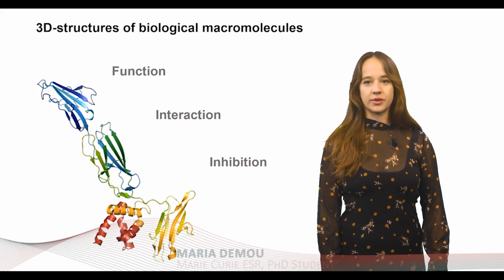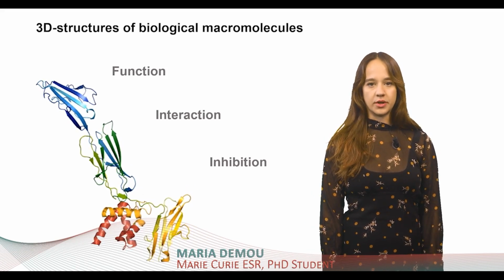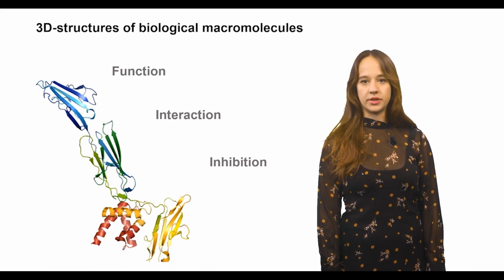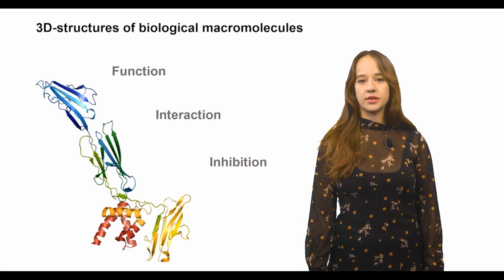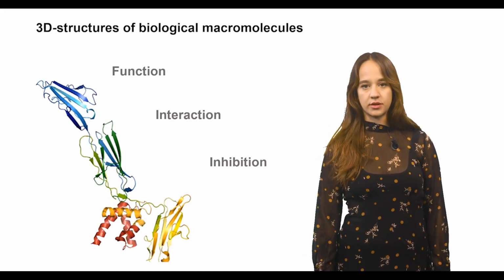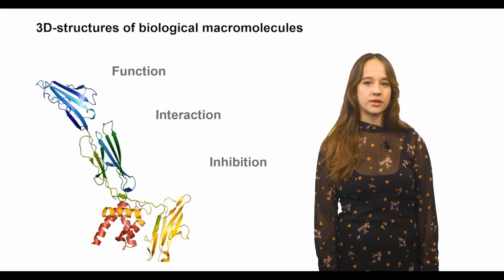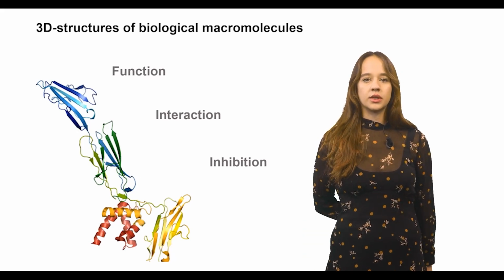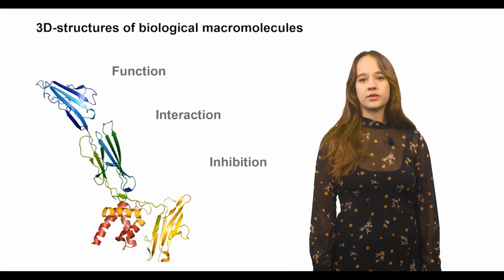Proteins are essential components of all living organisms. They play a crucial role in many biological processes, including cell structure, metabolism, and immunity. Studying the three-dimensional structure of proteins is fundamental to understanding their function. One of the most powerful tools for determining protein structures is X-ray crystallography. In this video, we will explore the process of protein crystallization and X-ray crystallography.